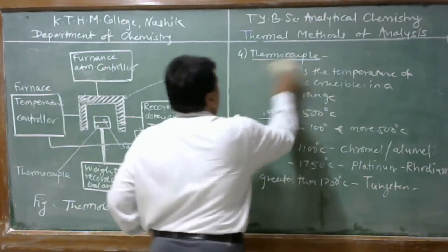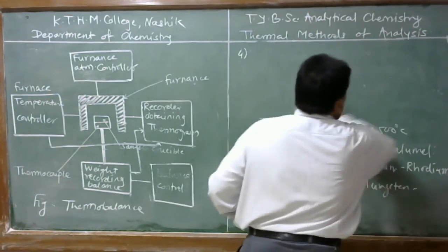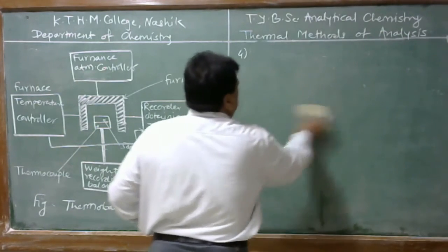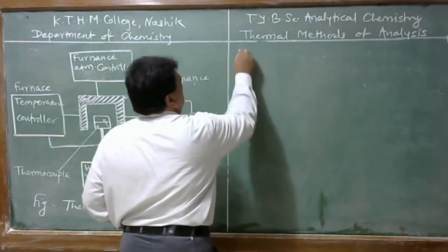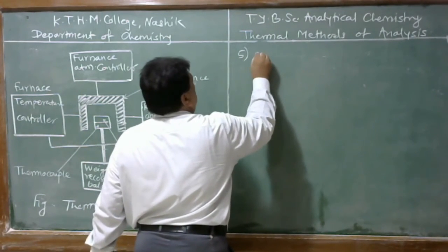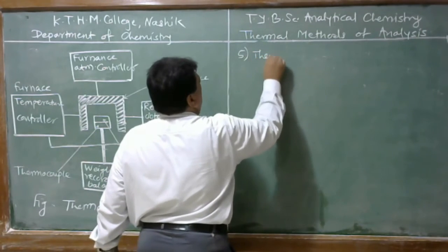Now, next component of the thermobalance is the recorder, that is a thermogram recorder.